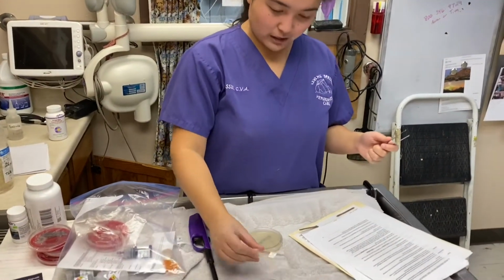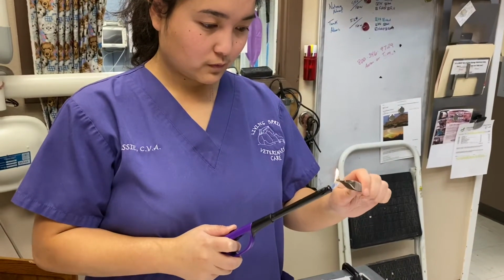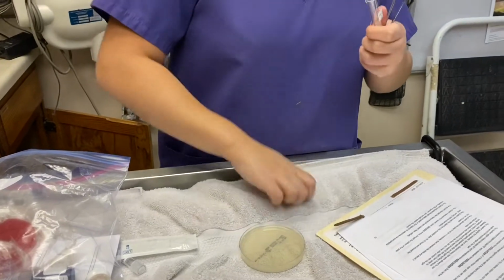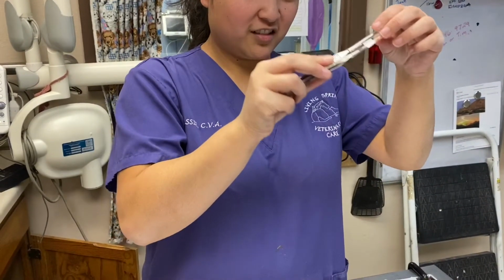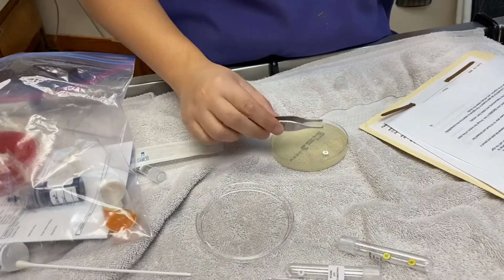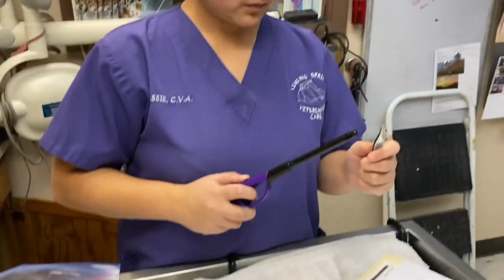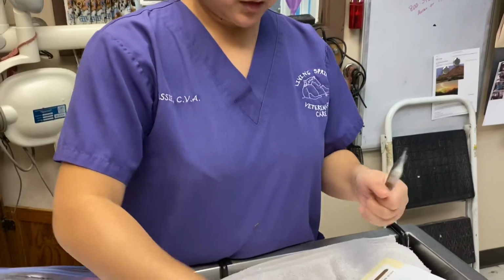Alright, so I have all of my antibiotic discs right here, and I have my forceps. So I'm going to heat those up. Okay, I'll grab one of the discs. How do I get it out? Okay, and place one. Do I have to heat it up every time? Okay. Grab my next one.